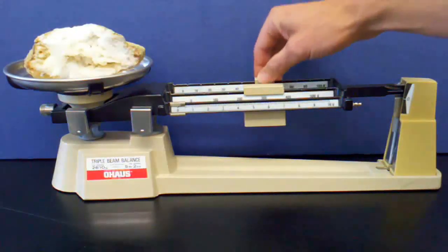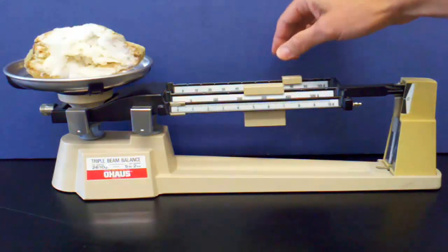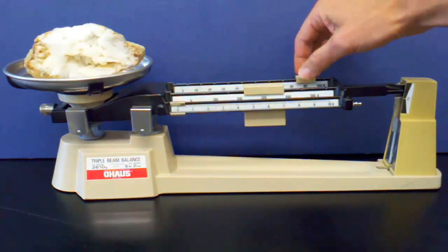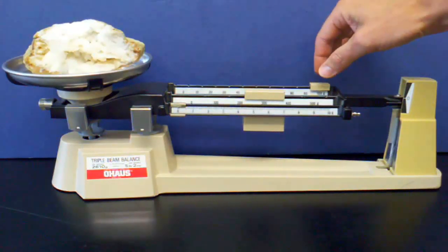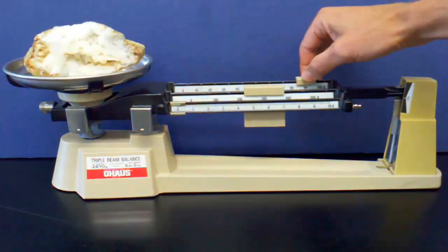I'll do the same with the 10-gram slide. I'll find out where it is heavier than the object in the pan as the balance tips, and then I will slide it back one notch.